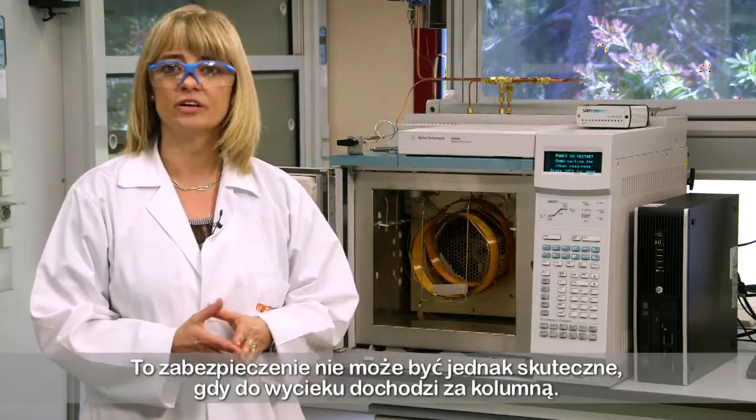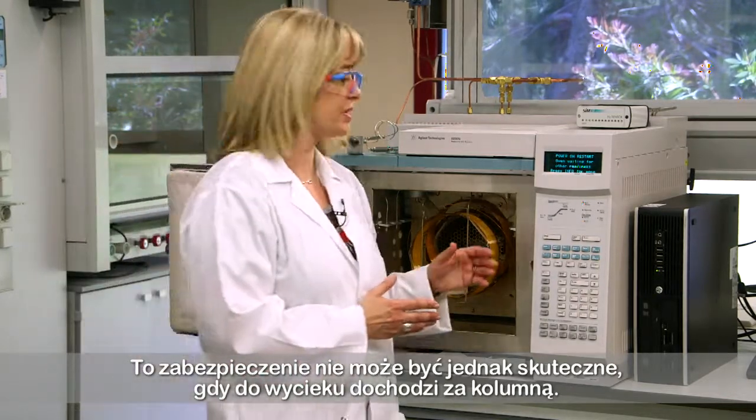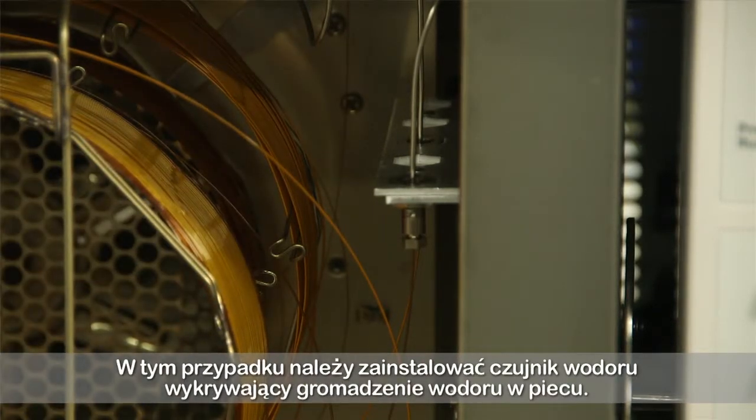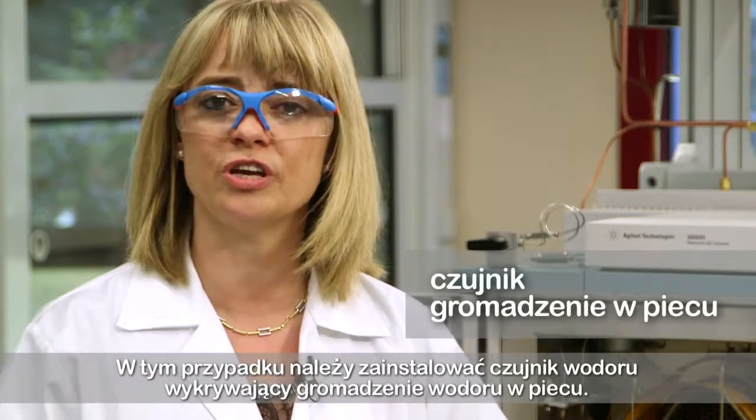However, this safeguard cannot be efficient when the leak is downstream the column. In this case, hydrogen sensors need to be installed to detect any hydrogen accumulation in the oven.